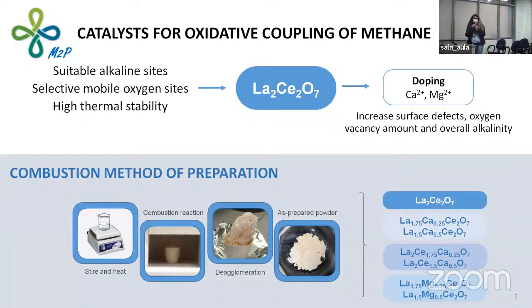Our materials were prepared by combustion method. We use urea as fuel. And the first step was dissolving the nitrates and urea in water under constant stirring and heating. The gel was taken to a muffle.